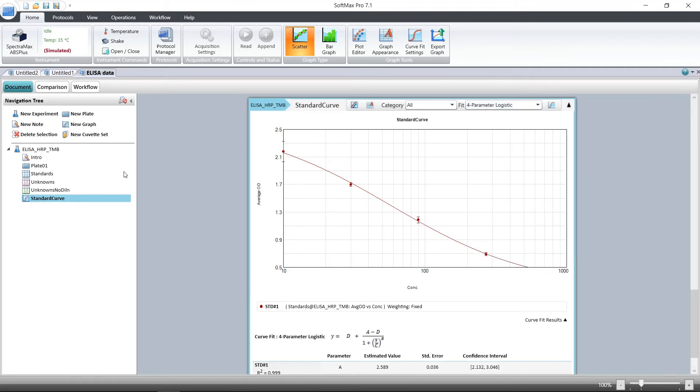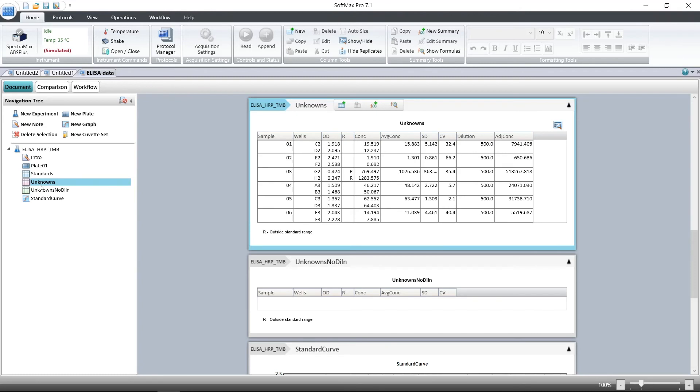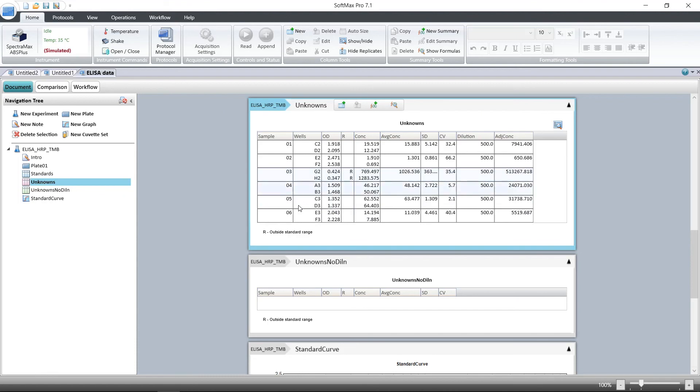The standard curve is used to interpolate the concentration of our unknowns shown in the unknowns group table. Here we see the value, the resulting concentration calculated from the standard curve, and the application of any dilution factor to arrive at the adjusted concentration. Any samples that fell outside of the range of the standard curve are denoted with an R.